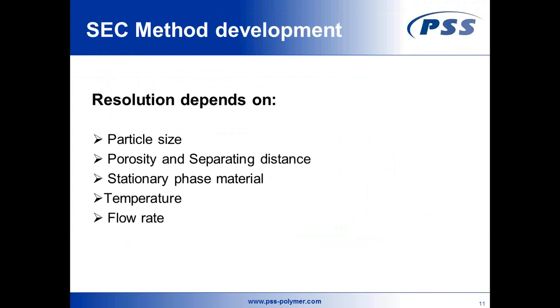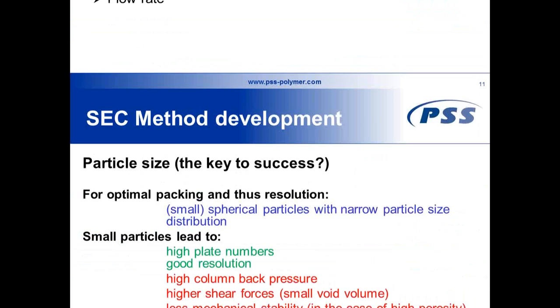So, we need to talk about how we could improve the resolution, how we could maximize the resolution, and therefore we do have a couple of parameters to talk about. It is the particle size, the porosity, the stationary phase itself, the temperature, and the flow rate. And how you can influence your resolution and improve your results, that's what I'm going to show you in the next couple of slides.